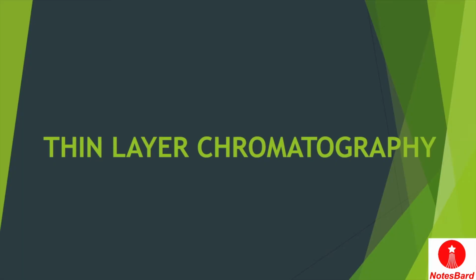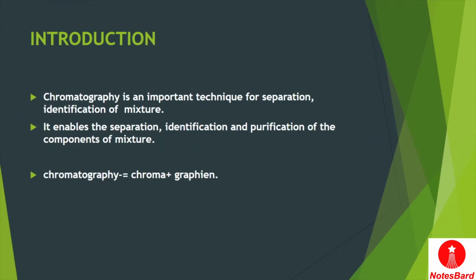Hello everyone, welcome to another video tutorial. So in this video lecture we will discuss another type of chromatography, which is named thin layer chromatography, or commonly known as TLC. So let's start with the introductory part.